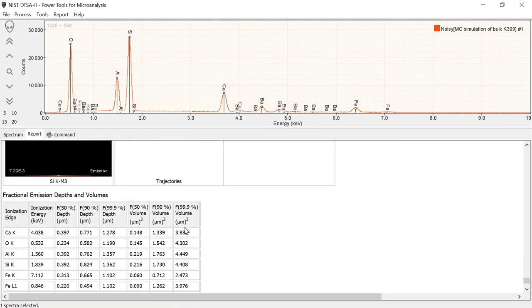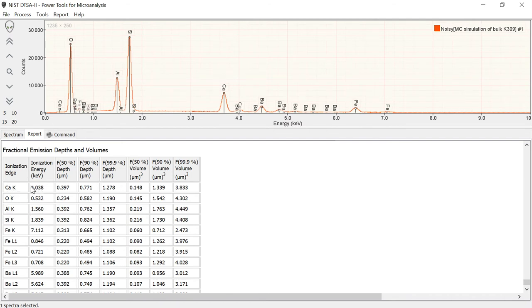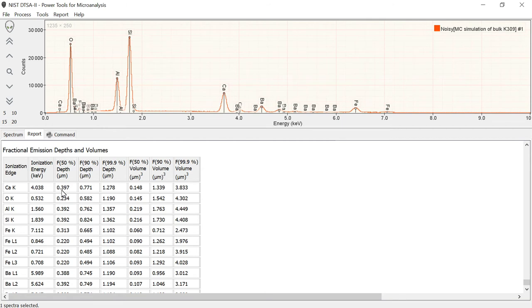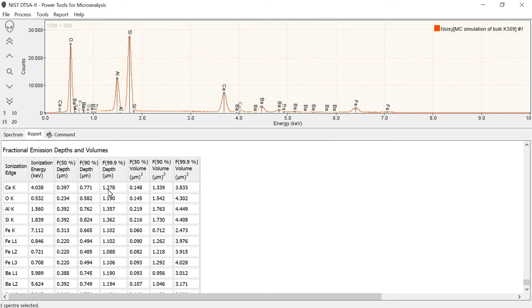We also get some information on fractional emission depths and volumes. So for a specific shell, so calcium K, oxygen K, aluminum K, they have a certain ionization energy. And then this column basically tells you that 50% of the x-rays were generated within about 0.4 microns of the surface. And 90% were generated within 0.77 microns of the surface. And 99.9% were generated within 1.2 microns of the surface. So this tells you that essentially the depth of penetration and the generation of the x-rays was down to 1.2 microns deep in the sample for that particular line. And it varies with lines. The harder x-rays, like the iron K, it might be a little less. For the slightly softer x-rays, it's a little more.